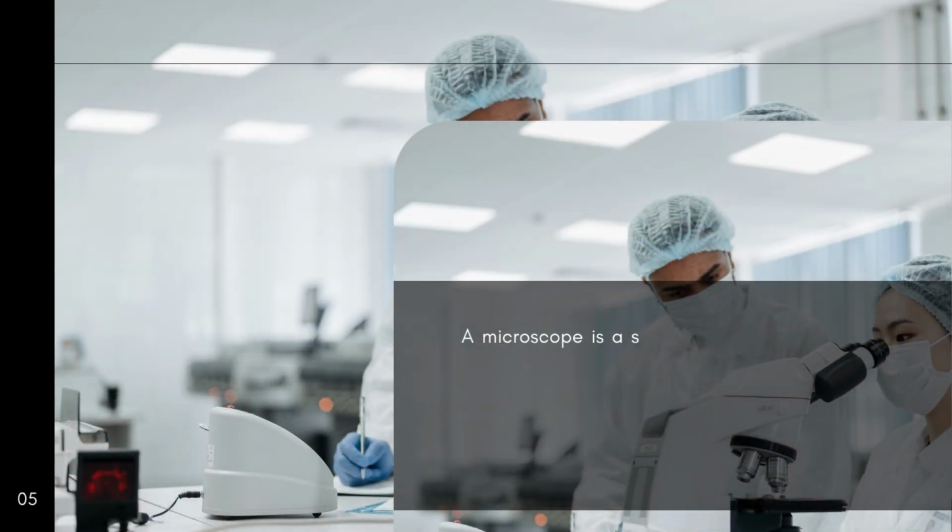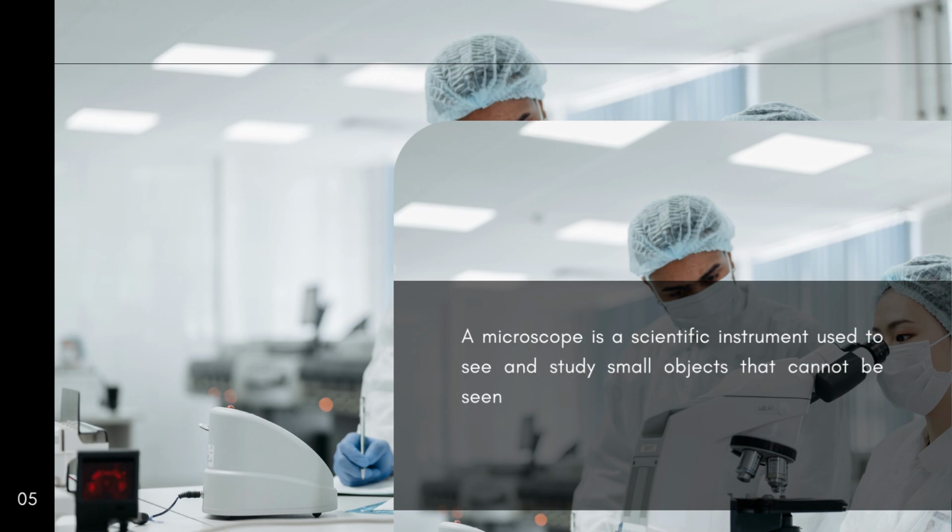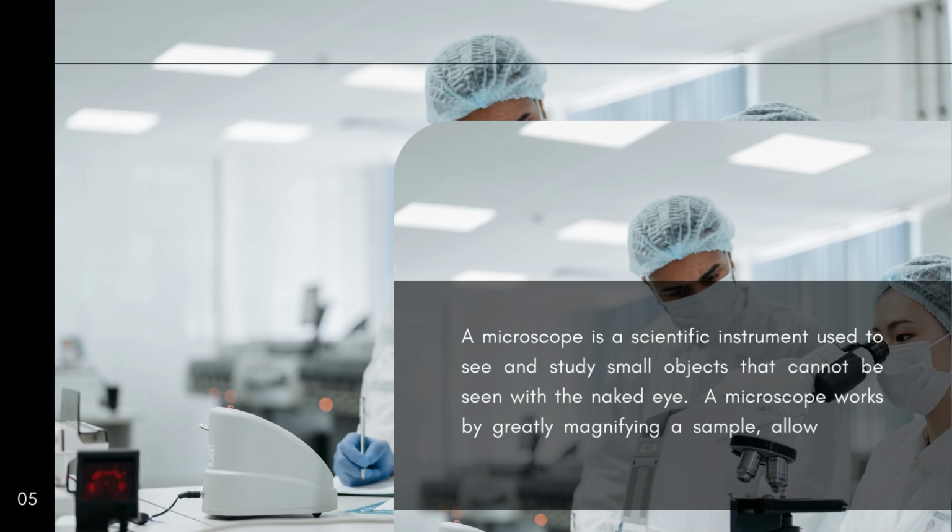A microscope is a scientific instrument used to see and study small objects that cannot be seen with the naked eye. A microscope works by greatly magnifying a sample, allowing the user to see fine details and small structures.